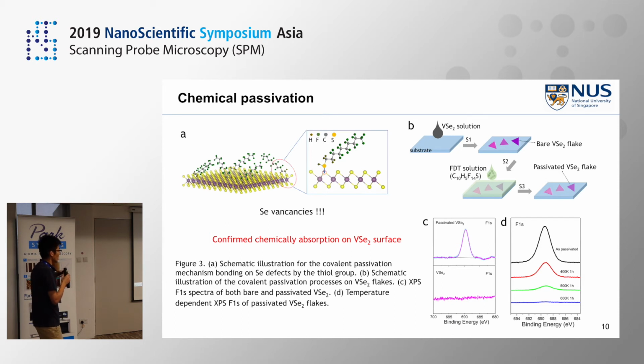Then it can be used in other characterization techniques such as the MFM, because MFM works in the air, so we need to use stable materials.